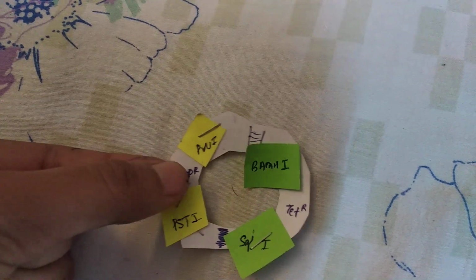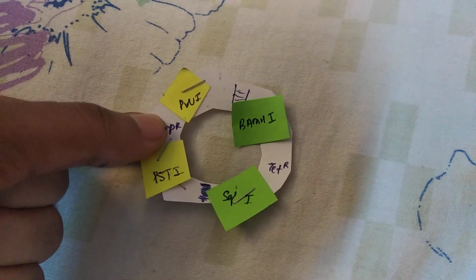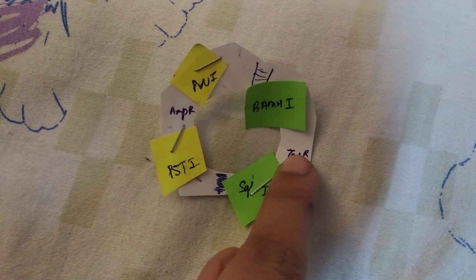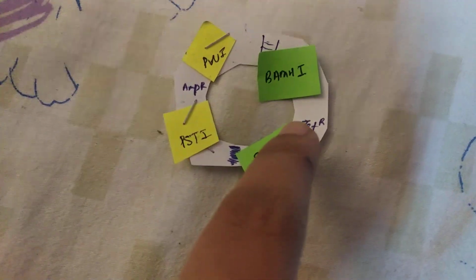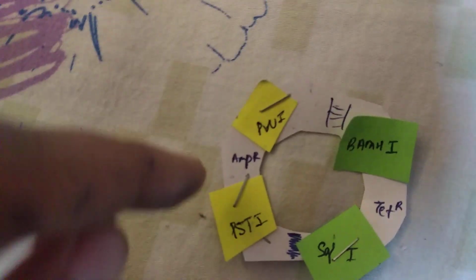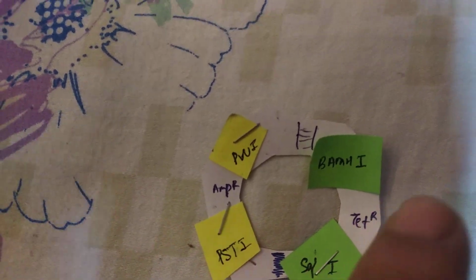So as you can see, this plasmid doesn't have any gene of interest, right? Now what I'm going to do is introduce a gene of interest at this point right here, where my tetracycline resistant gene is located. And as I insert the foreign gene of interest, the gene is going to get inactivated due to insertional inactivation. Now this is my foreign DNA, and I'm going to cut a foreign gene of interest from this, right?